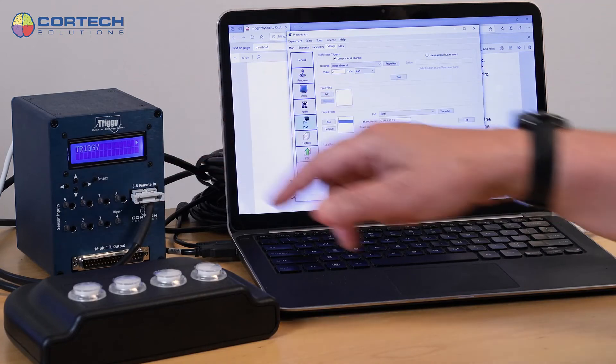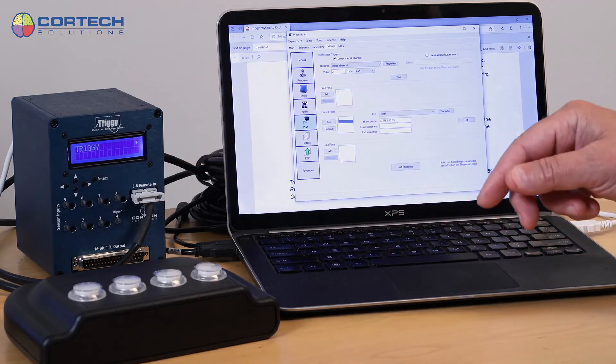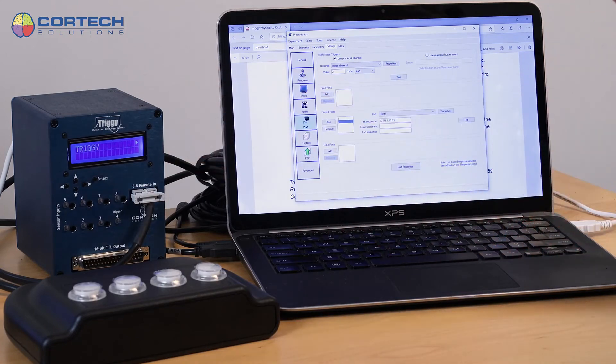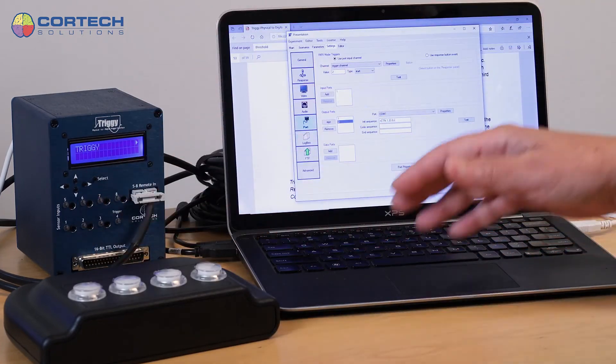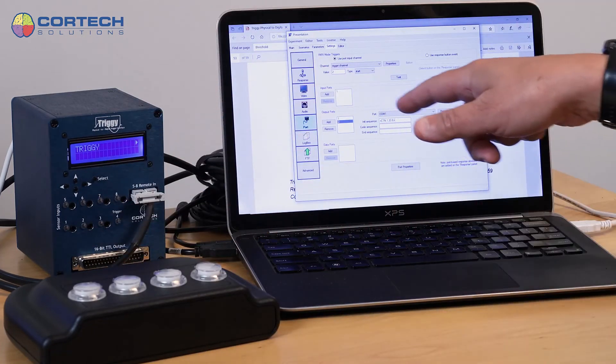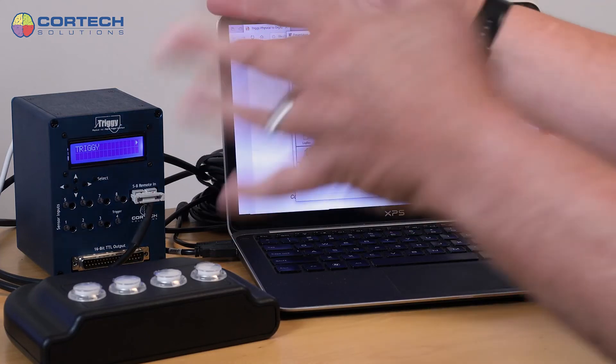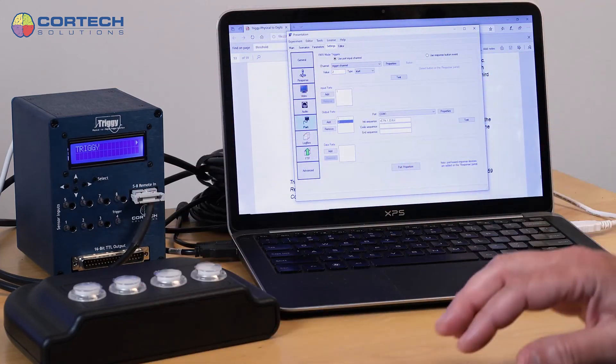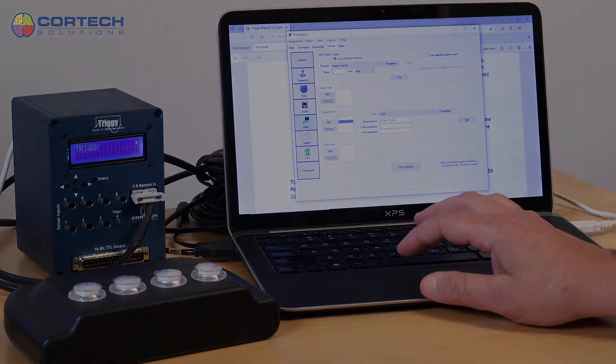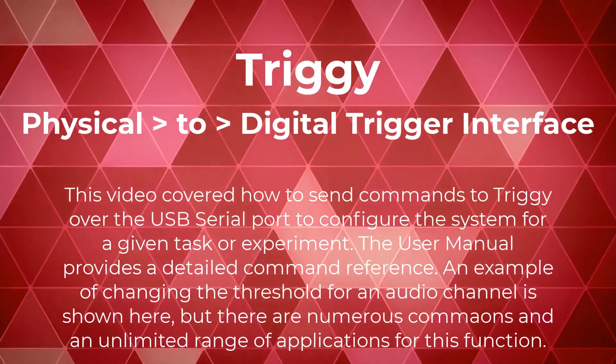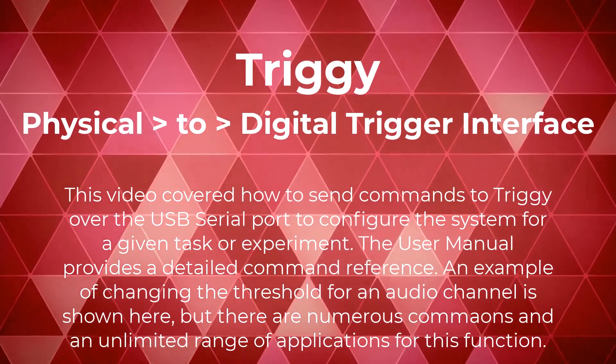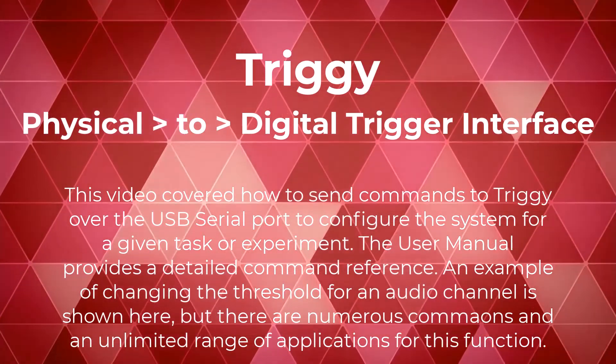And that channel will be configured as you desire. You can also send a whole string that configures the whole system for whatever your purpose is.